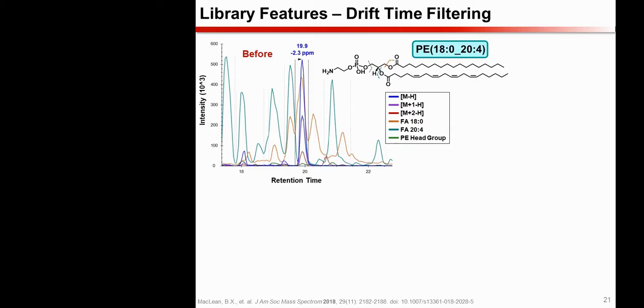And our DIA method does not do any precursor isolation when we're fragmenting. So the same fragment can be seen along really wide ranges of our gradient. And so in some cases, these fragments can completely drown out the precursor, and this makes it difficult to annotate lipids and can throw off the relative intensities of our spectral library match.